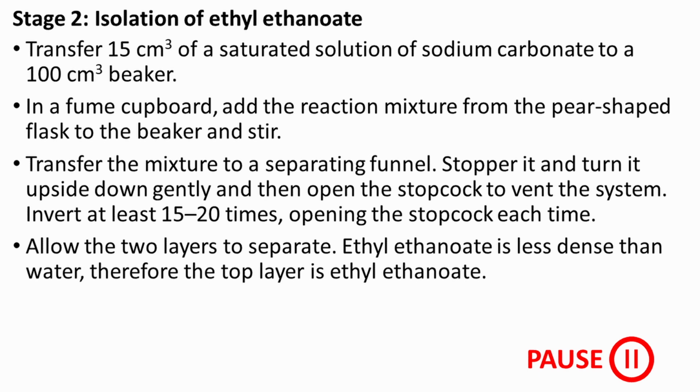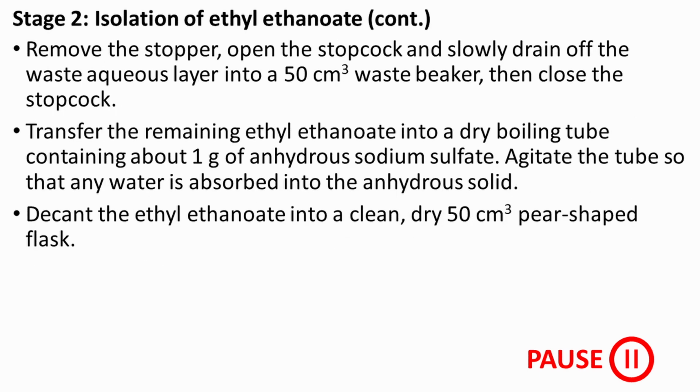This is the first part of the procedure for stage 2 that we have looked at in this video. Please note that any practical work must only be carried out under the supervision of persons qualified to do so after completing a risk assessment. I won't read each line, you can pause the video if you want to do this. And here's the second part of the procedure for stage 2 involving the drying agent.